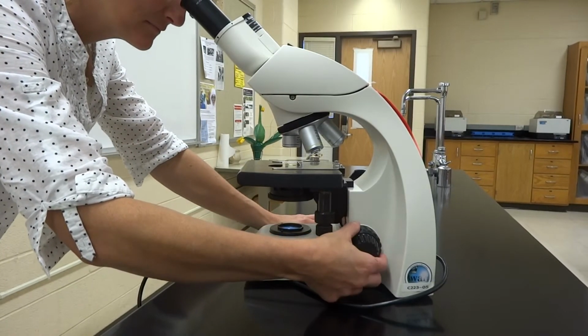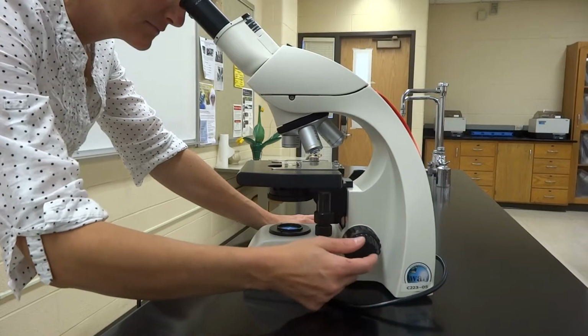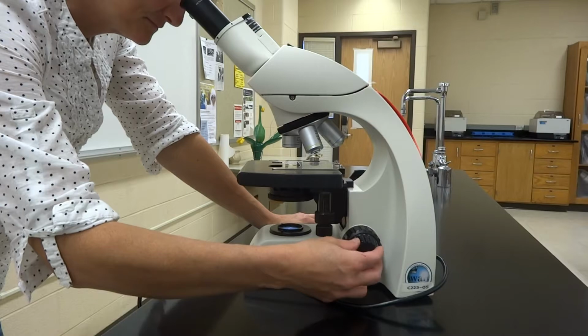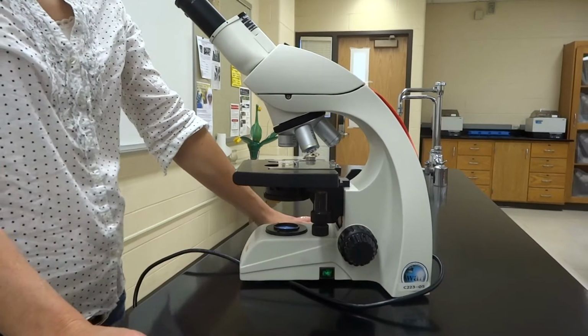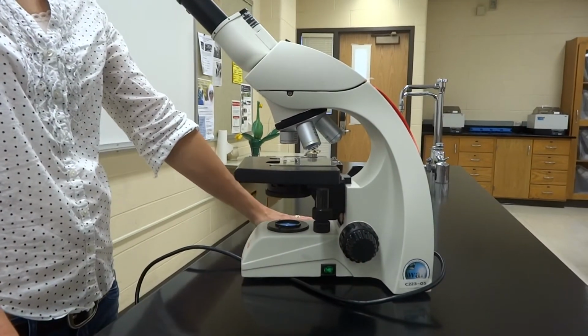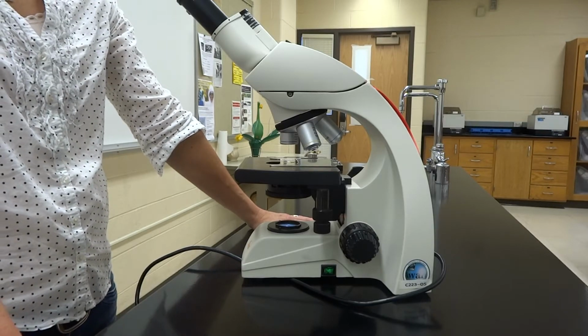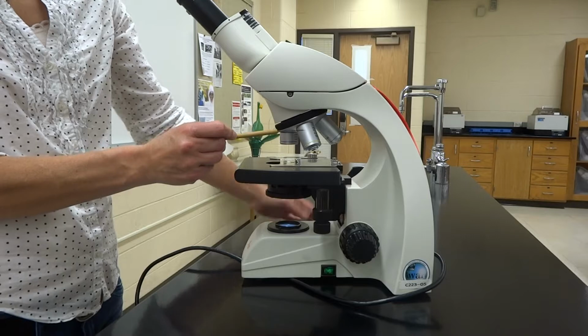And once you've got it most of the way, you can always use that fine focus, the outside knob, that will pull that into picture perfect view for you. Now, depending on what you're going to look at, you're not going to see a whole lot. So it's going to be important for us to zoom in. That's why we have these other objectives. We have a 10x and the 40.